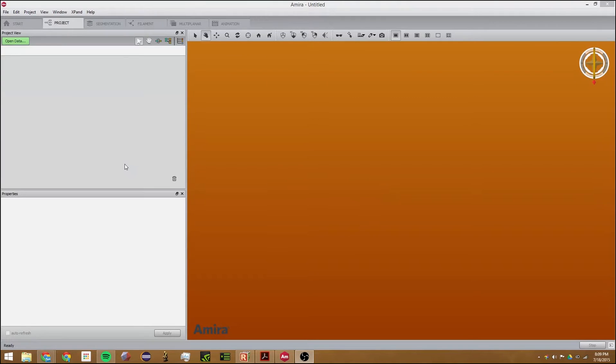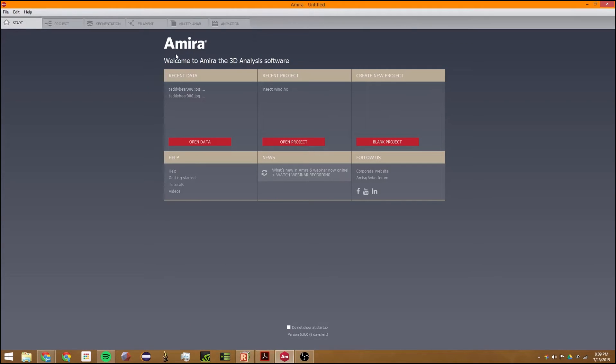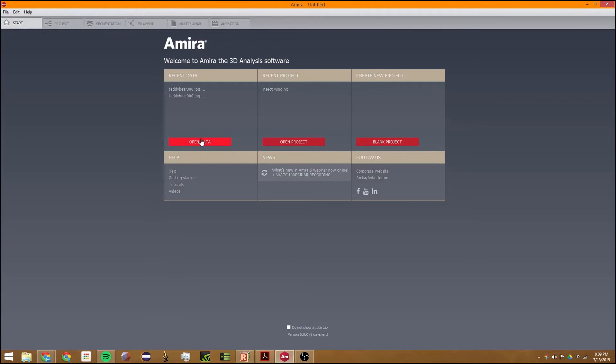Hi, my name is Sam. This is an Amira 6.0 tutorial. In this tutorial, we will go over the very basics of Amira. The first thing I want to show you is the start menu, which allows you to create new projects, open recent projects, and open data. The first thing I'm going to demonstrate is how to open data.